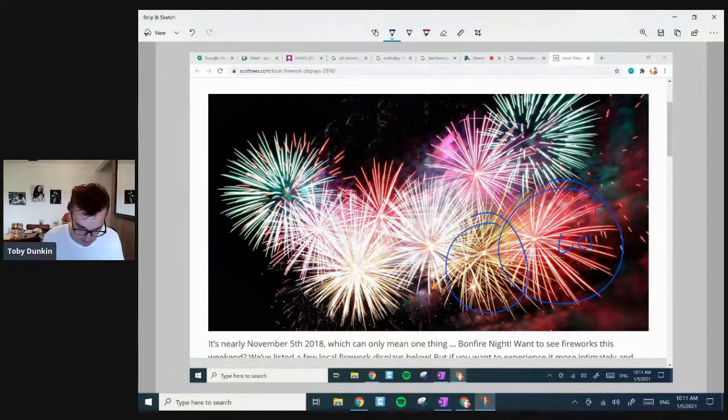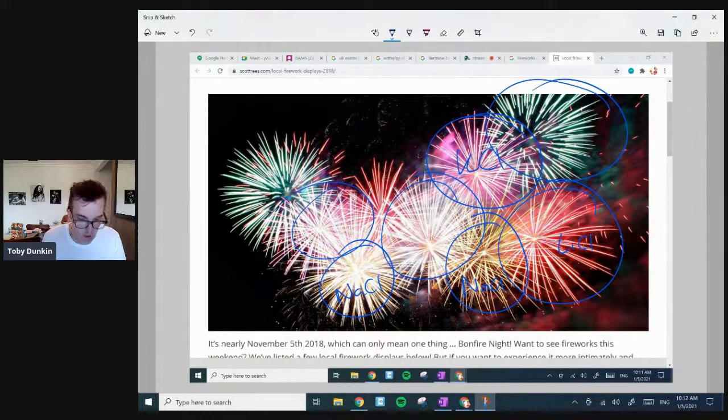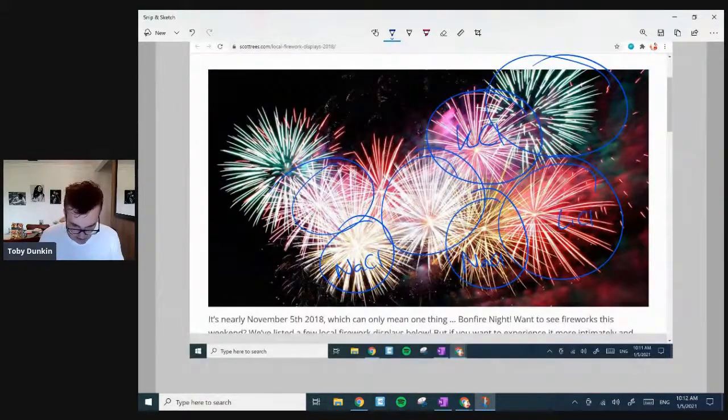The yellow color that you can see here and here is probably going to be the fact that they've added sodium chloride to this. Sodium chloride contains the sodium ion, which is going to produce the yellow flame. The pale pink up here is going to be the fact that they've probably added potassium chloride. They tend to do the chlorides because the chlorides are easiest to find. There's more chlorides than any other salts, so they use those ones. And then they could have added copper 2 chloride for the greeny blue. If you're wondering how they make the bright white and gold colors, the sparkles, they're not adding in salt, they're adding in metals there. Just to show you that.